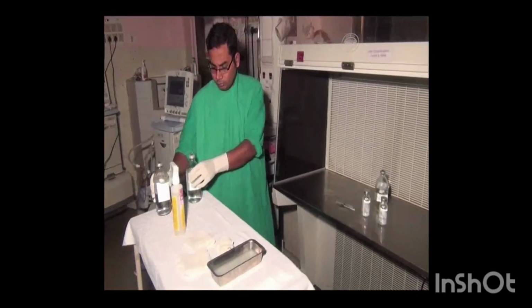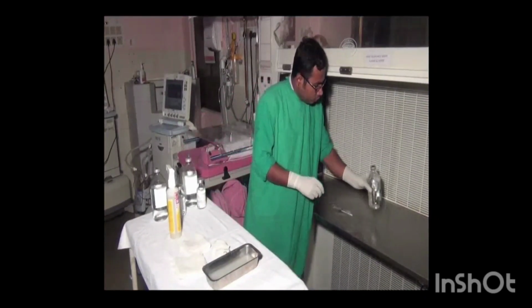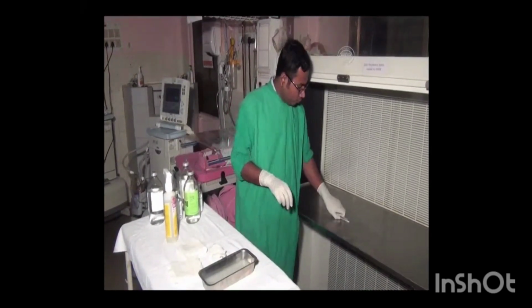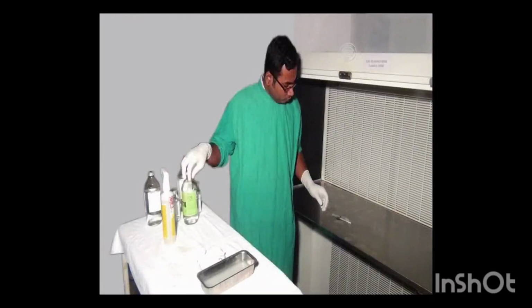Cleaning of the laminar flow hood. In the following section, we'll go through the steps of cleaning of a laminar flow hood. Because this is of paramount importance, until and unless the laminar flow hood is cleaned diligently, it can itself give rise to a number of infections and hazards. In the next section, we'll go through 7 steps which will ensure, if properly followed, that there would not be any hazardous complication arising of improper cleaning of the laminar flow hood.